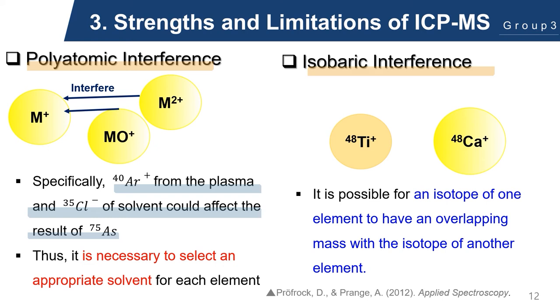For example, an argon-40 cation from the plasma would combine with a chlorine-35 anion from the solvent to interfere with the arsenic-75 signal within our sample. Thus, it is imperative to select an appropriate solvent to avoid polyatomic interferences. On the other hand, isobaric interferences arise when isotopes of two different elements overlap in mass, as can be seen in the diagram on the right. In this case, we would have to select other isobars for analysis.